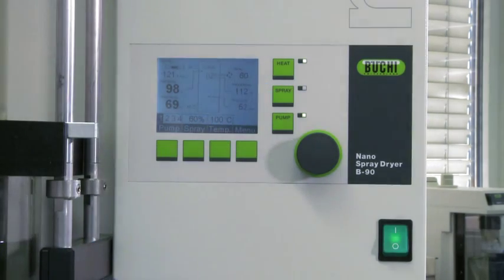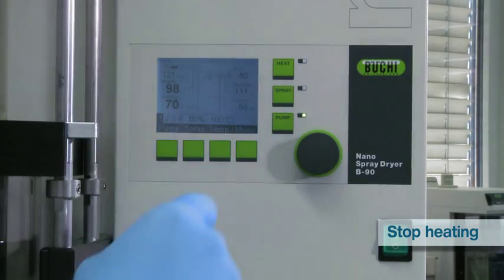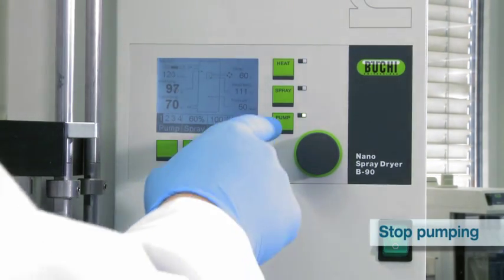Switch off the spray head by pressing the spray button. Switch off the heater by pressing the heat button. And switch off the pump by pressing the pump button.